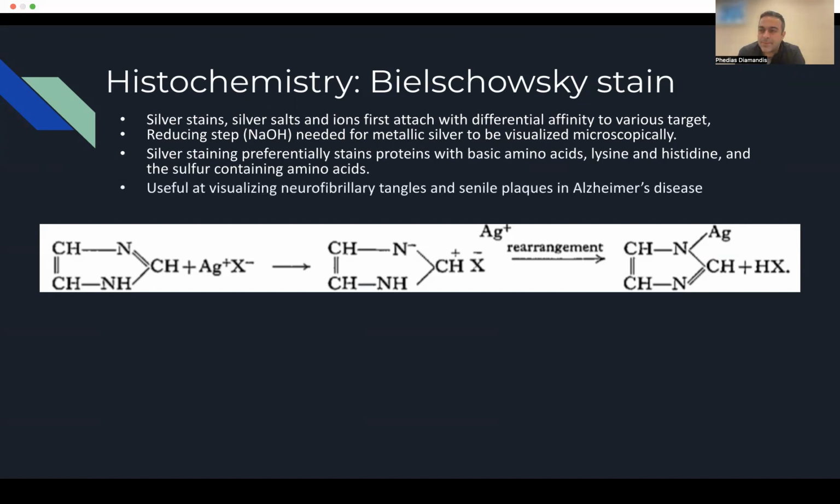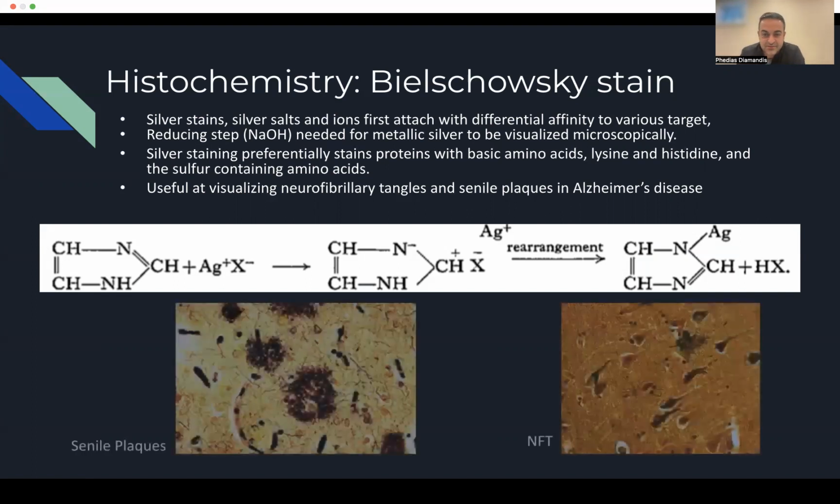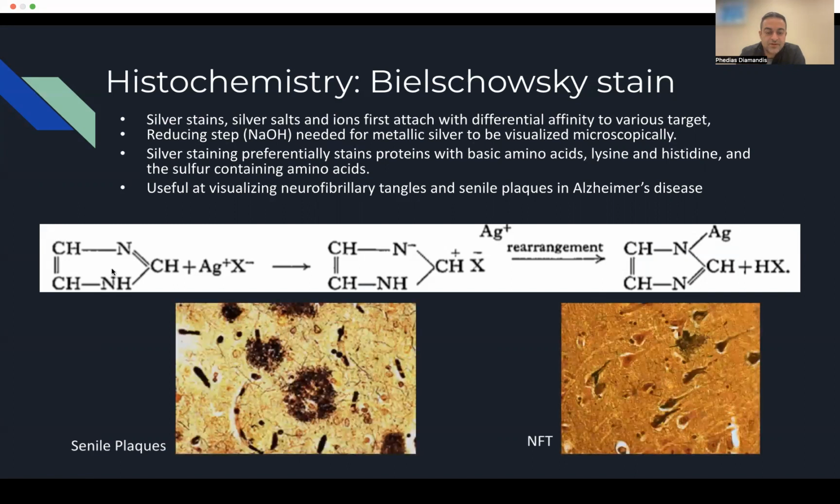And so this, for whatever empirical purposes, works very well for protein aggregates. This will work well for plaques in Alzheimer's disease, as we'll see here. So it's very useful for specific use cases, such as quantifying the disease burden in Alzheimer's disease.